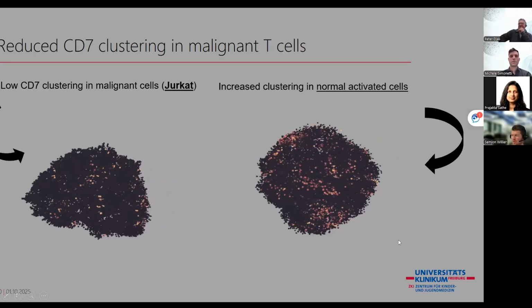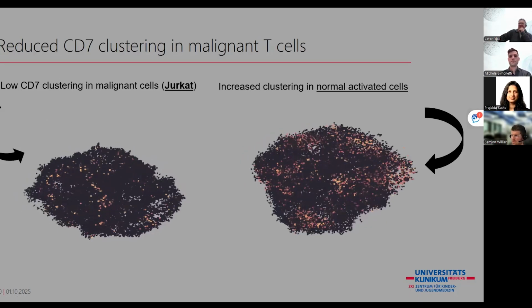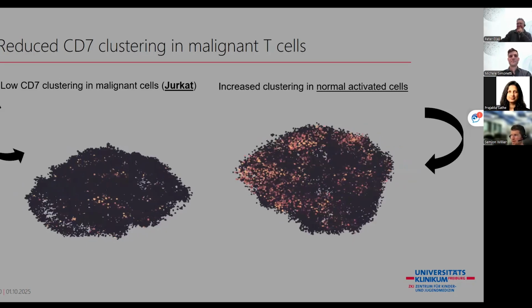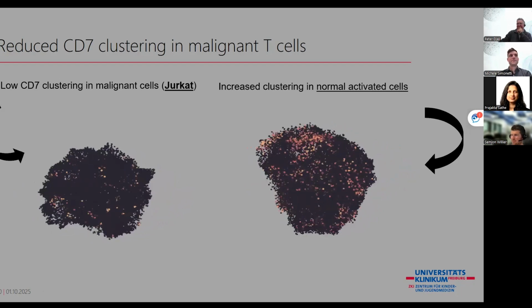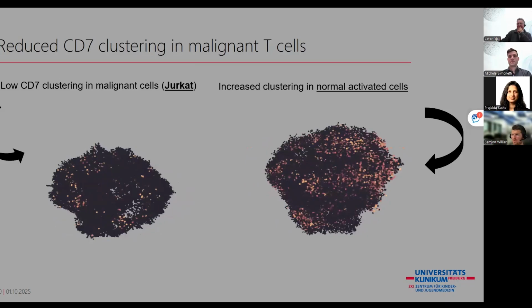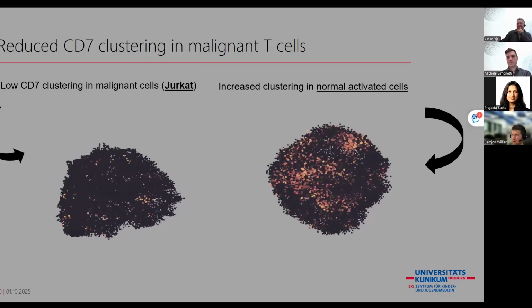So for me, this has taken a few months, but I think it's a very interesting technology that comes at the price of not having the data right away when you finish your flow cytometry analysis, but you have to go through the NGS analysis.